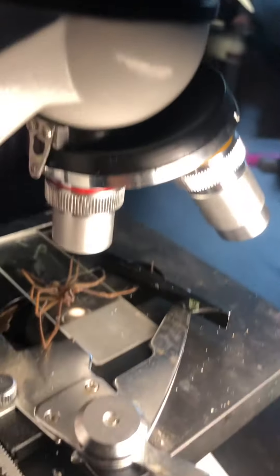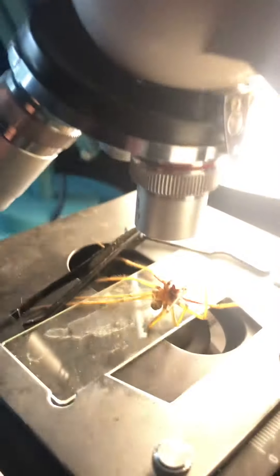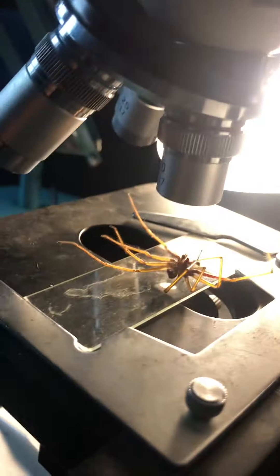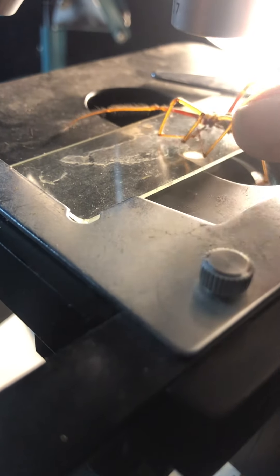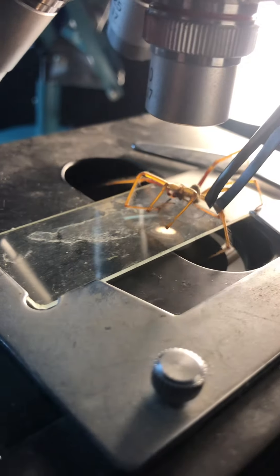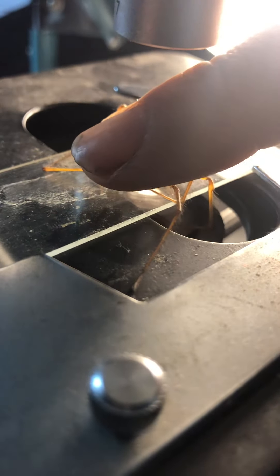I think we'll need to flip it over to actually see the leg well. Can you flip it over? Because I don't like spiders. I think we're going to get that one right there. We'll spin it around and we'll get his eye on as well.